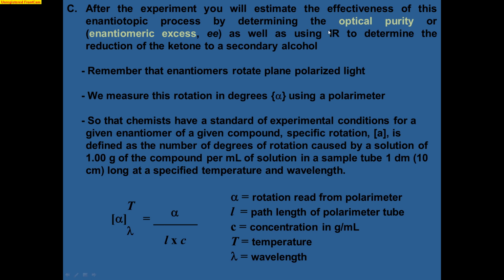The other thing that's important to bring forth is this idea of optical purity. Because we are generating a new chiral center, once we isolate this product out, it will have the ability to rotate plane polarized light.